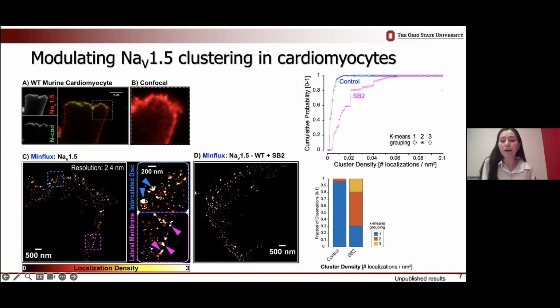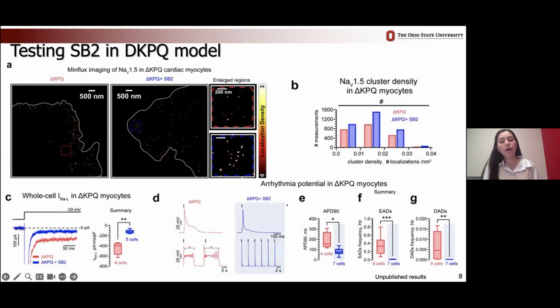Once we were able to validate that we could visualize these clusters with this technique, we then wanted to see if we could manipulate sodium channel clusters and quantify this manipulation with image analysis. Therefore, we treated the same cardiac cells with a drug, SB2, which is known to enhance sodium channel trafficking. We tagged the sodium channels, imaged them, and then through an image analysis software I wrote, we were able to assess the cluster density and cluster sizes and confirm that SB2 was able to enhance sodium channel clusters and density. We then wanted to test this method in one of the disease models our lab is currently studying, delta KPQ.